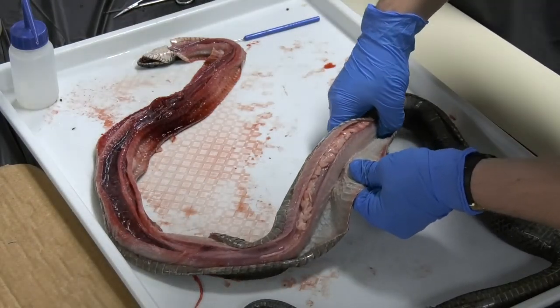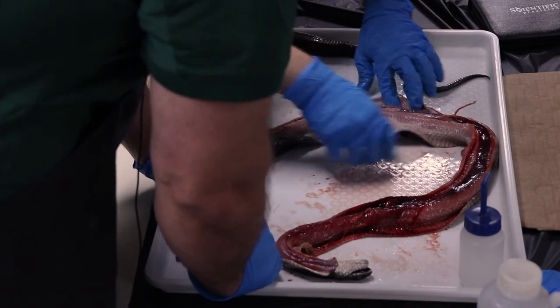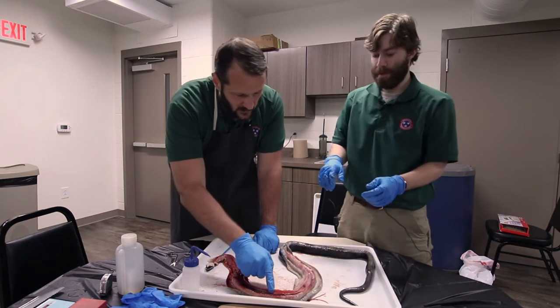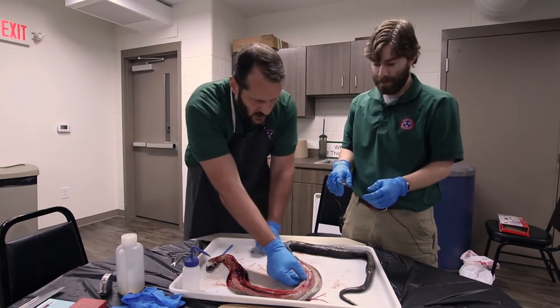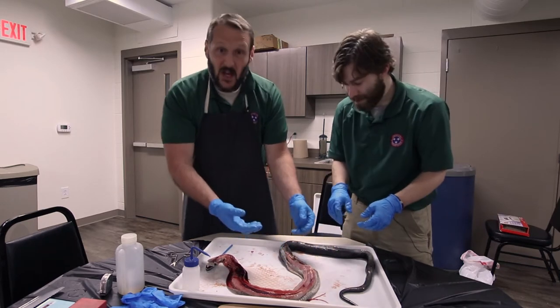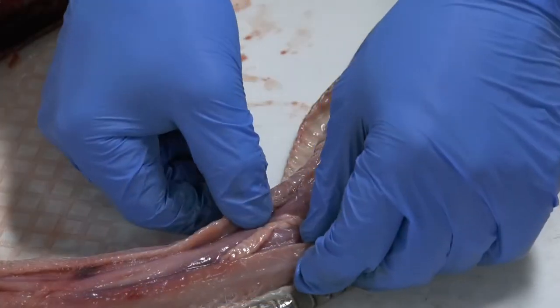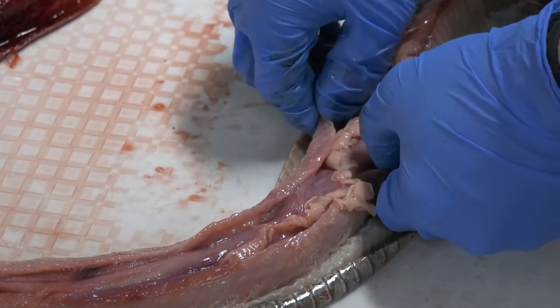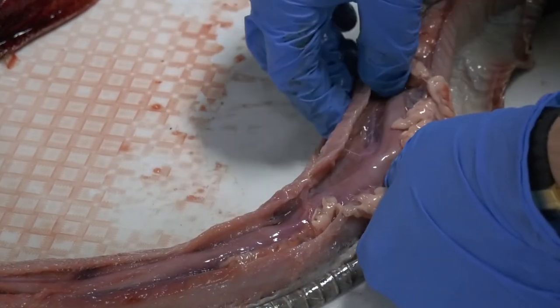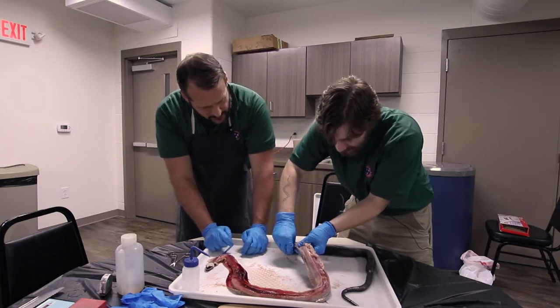Looks like we've got some fat deposits here. That's exciting. Now we're talking. So this right here, I'm guessing, was the esophagus, leading into a large stomach, with some fat. And just like many of our mammal stomachs, surrounding that stomach is belly fat. I'm not going to rub my belly, but I've got some too. It doesn't really look like there's anything in the stomach. Aw, rats. It's a little black rat snake joke for you there. Or I should say, not rats.